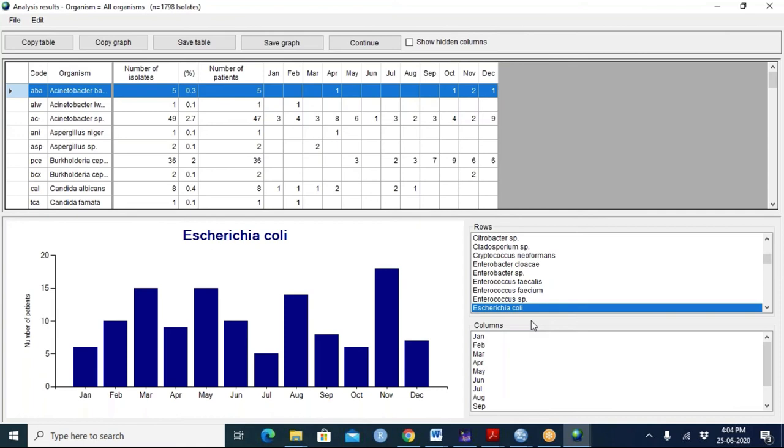Sometimes it means data entry is incomplete, or sometimes EPHI is different because hospitals usually have a pretty steady amount of volume. Every month, a similar number of patients come in. A national reference lab, it might vary more because they're doing research projects and this and that and the other. So when you look at this, what you might see is that some months might be missing. You might see data from the year 2040. That would be a typing mistake.